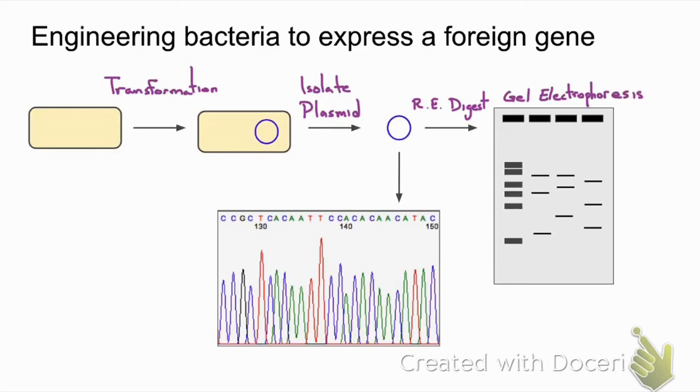And we'll talk about this process in detail. Typically, a follow-up to this then would be a sequencing reaction, where we would design primers specific for the gene that we have placed into the cloning plasmid, and now we would determine, does it have the correct order of A's, G's, T's, and C's? In other words, is it capable of forming a functional mRNA and a functional protein?